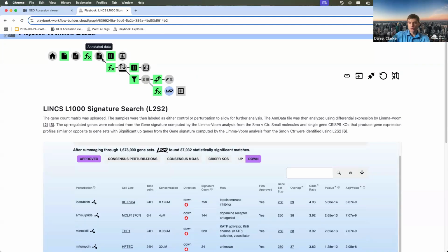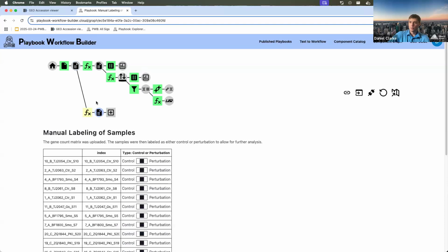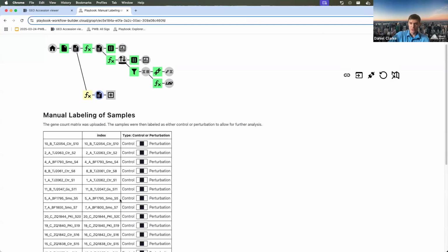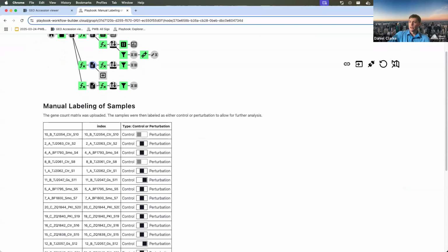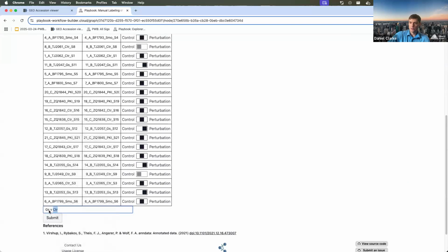But one thing we want to do is look at these other sets as well, these other comparisons. So what we would do is come back here and then relabel to go through the other ones. And to save us some time, I've done this already. So if I come here, we can see we have the workflow we had before, but now I've annotated this B section as the G subunit.